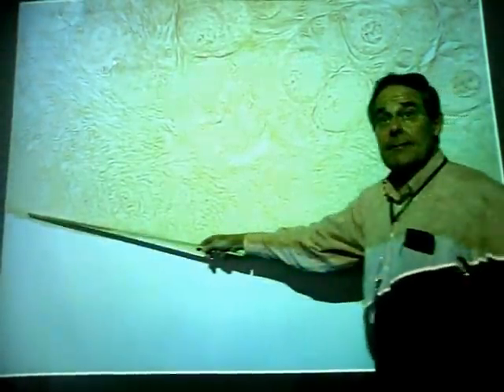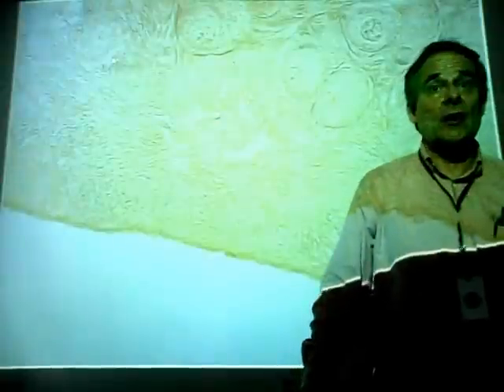Okay, first off, you look at the edge right here, this dark kind of yellow line, this is a layer of simple cuboidal epithelium. It has a fancy name, what's it called?